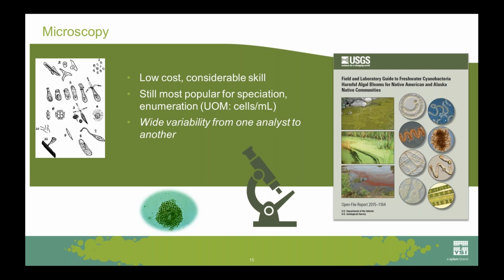So that's pretty interesting that here we are 400 years, 350 years later, maybe, still using microscopes to look at blue-green algae. Now, today, they are still very, very popular because, as I mentioned, they're affordable, and you can tell a lot about the community of algae at a site just using a microscope. It is the most popular tool for counting algae as well. People often want to know how many cells per mil there are.